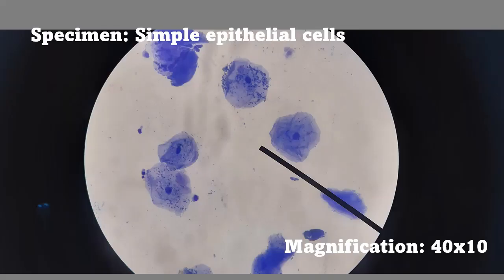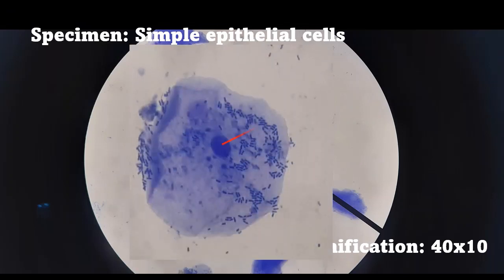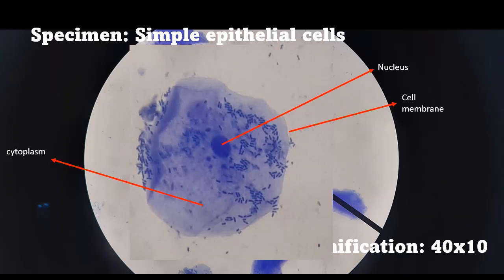Here is the larger image, and we can see it clearly. They have the nucleus, the cell membrane, and also the cytoplasm. So what about the things on the surface of the cell right here? Is it ribosomes? Is it anything that we might know? Basically, it's bacteria. Wow, so we have a lot of bacteria. We are the host for other bacteria. Hopefully they are good bacteria.